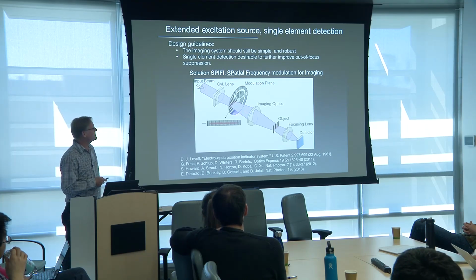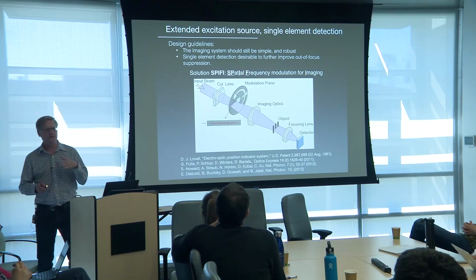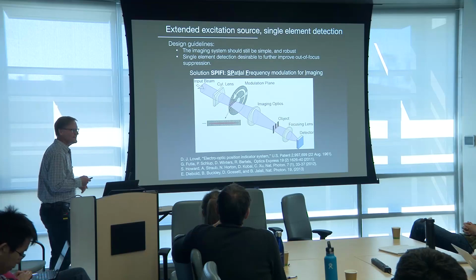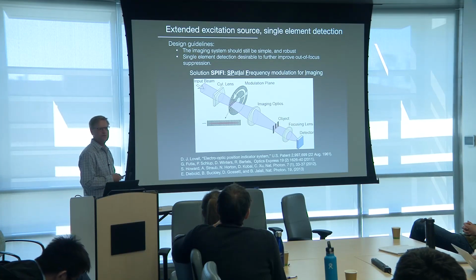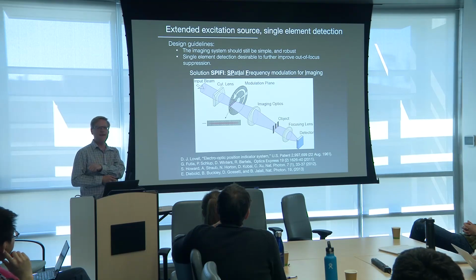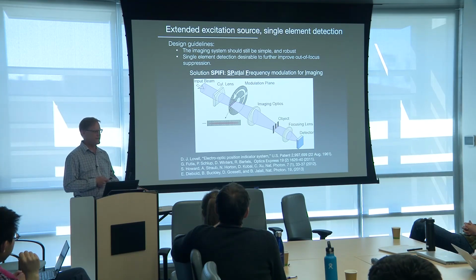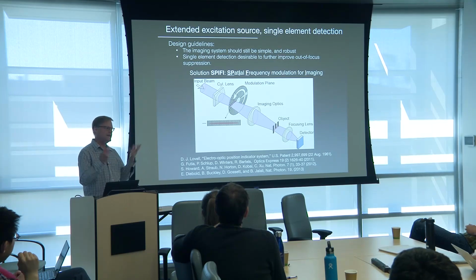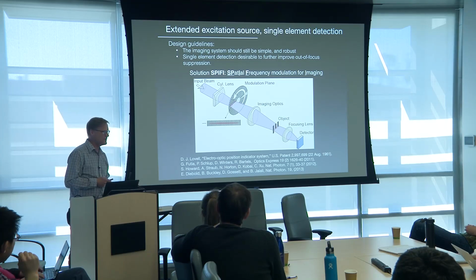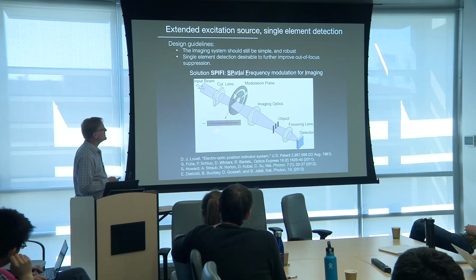And what we're going to do is now we've got a continuous source. And so each pixel that we'd like to resolve along that is our beam. So now, in principle, it does look like 100 beams or 300 beams. But I want to get rid of the camera. I want to go back to point detection. So if my system is scattering, I don't care as the light comes out. I can reassign the spatial position, whether it's the imaging with the fundamental, second harmonic, third harmonic, or fluorescence. I want to be able to reassign it.